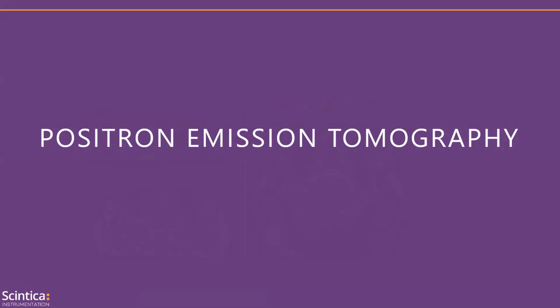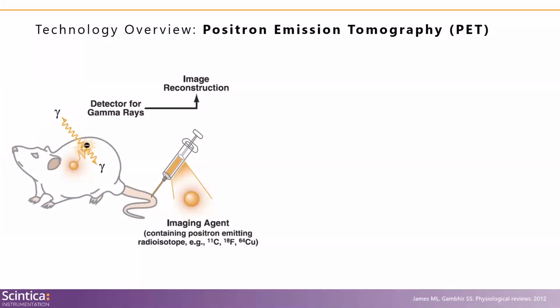Okay, so moving on now to positron emission tomography, or PET imaging. PET imaging is something some of the non-imagers may be a little bit more familiar with, due to the fact that it's routinely used clinically to diagnose and monitor the progression of numerous diseases, including a wide variety of cancers. But it's also commonly used in many areas of research.